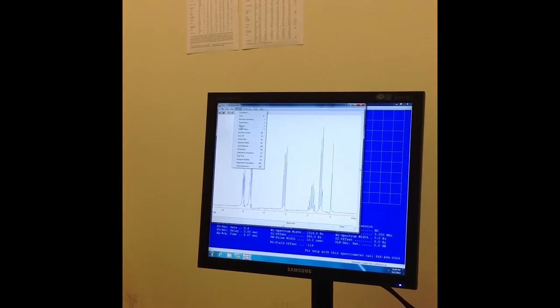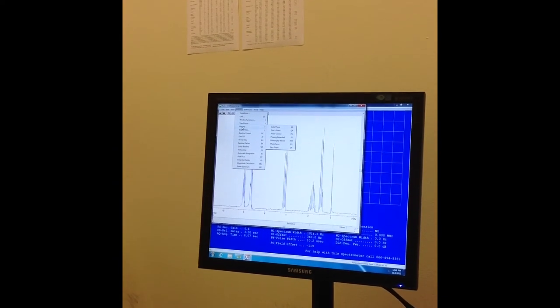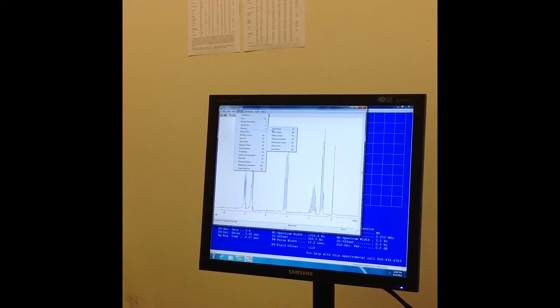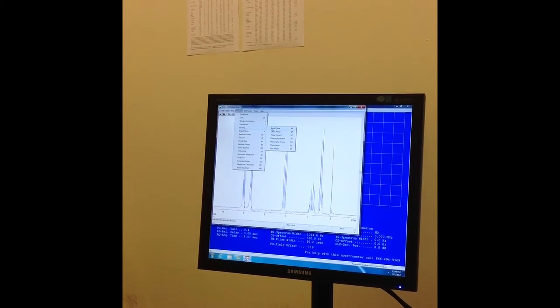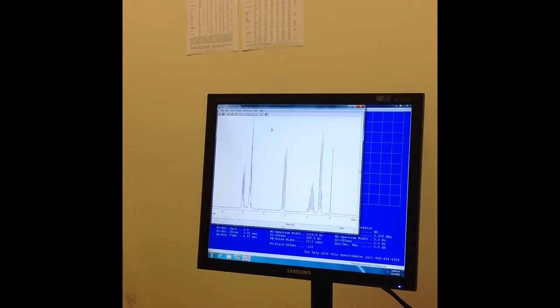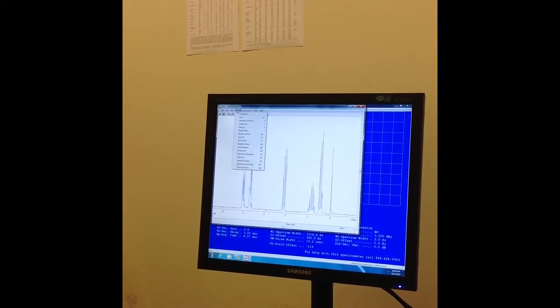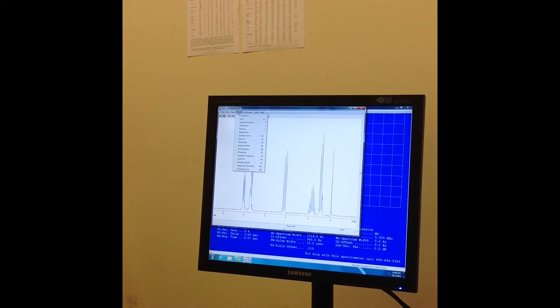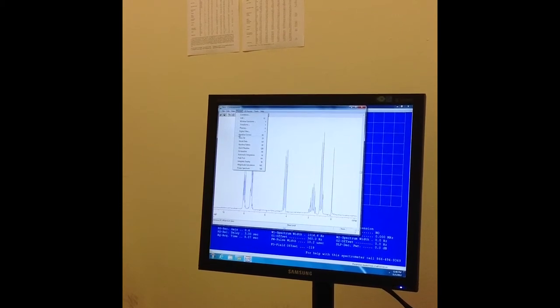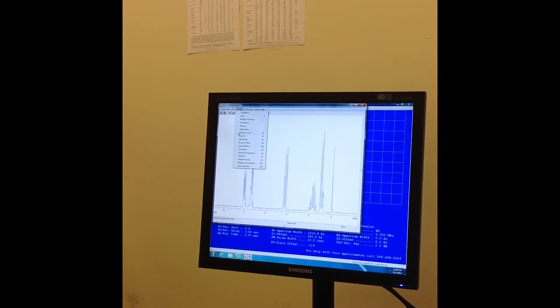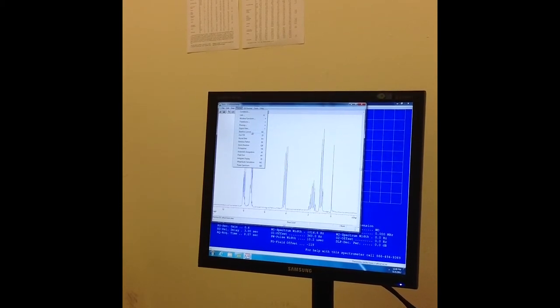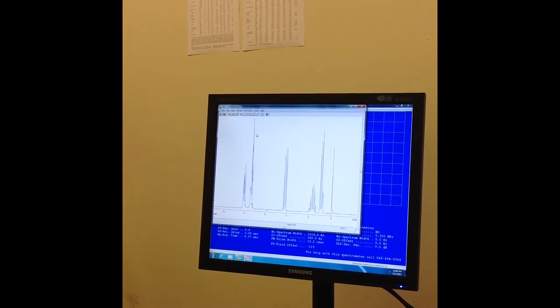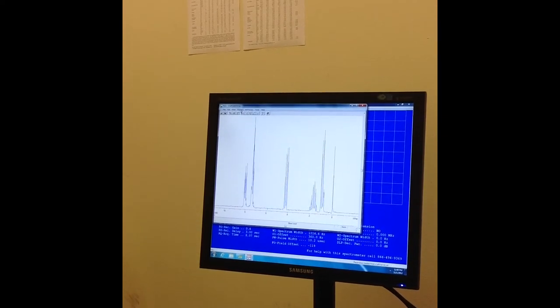We can do Phasing, and I'm going to click on Auto Phase. You don't have to click out of anything from there. Now I'm going to go down to Baseline Correct, under the Process tab again. I'm going to click on that, and then that's done.